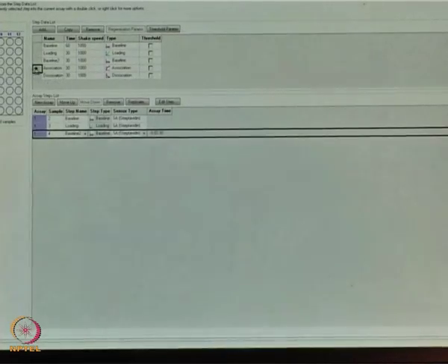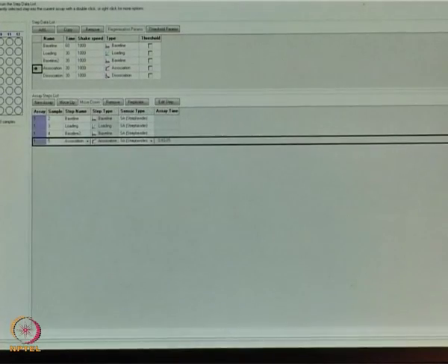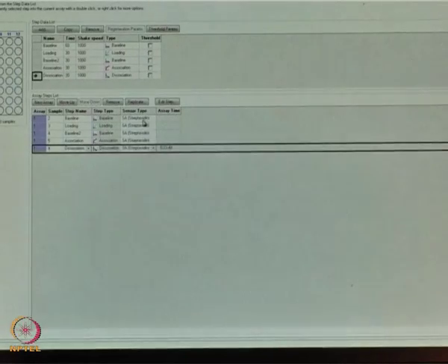Next step is the association step. This is the sample, the mouse monoclonal antibody, 2-fold diluted, 6 data points. Then for the dissociation step I am using the same buffer, that is column 4. Okay, these are the types of sensors we are using. I am using a streptavidin sensor.